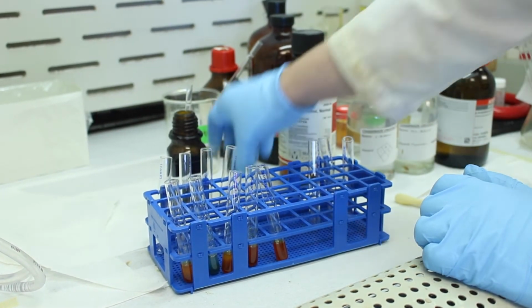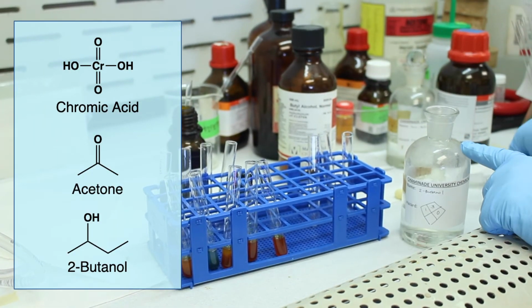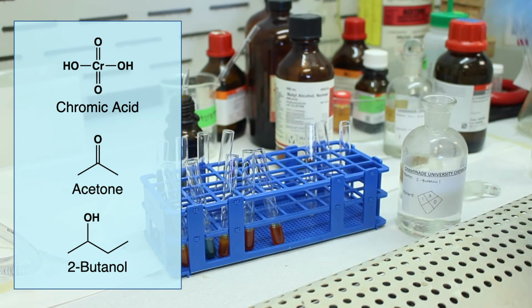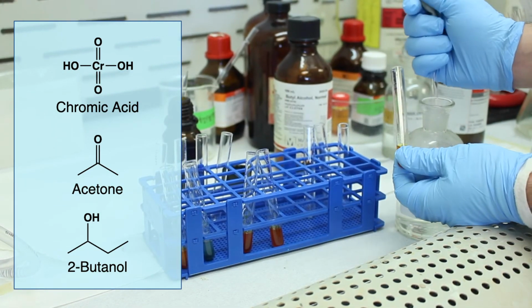Now let's do 2-butanol. So this is a secondary alcohol, and our expectation is that this will also react with chromic acid because it has 1 alpha hydrogen, so we can still oxidize it to the ketone. Okay, so here's our 2-butanol tube. We're going to add it here.